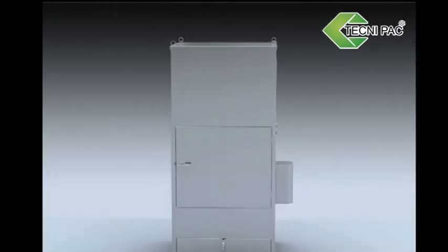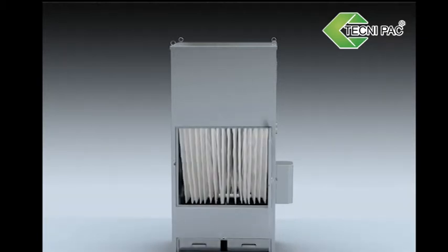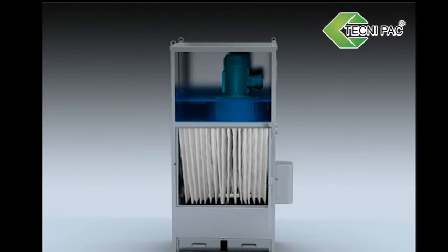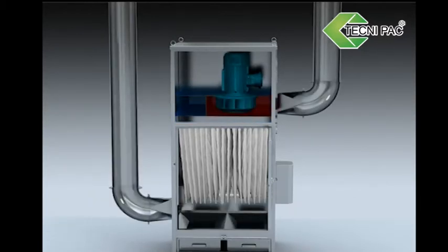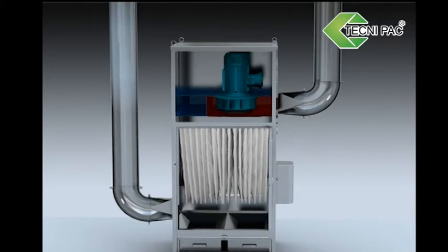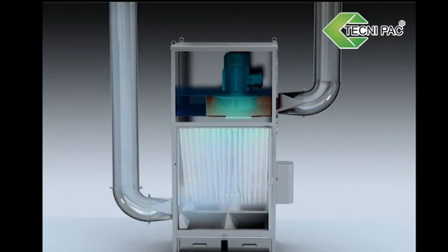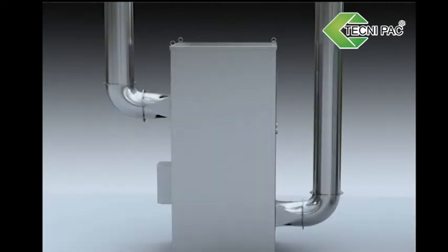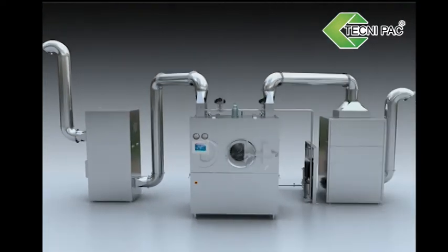Exhaust Machine. It mainly consists of ash drawer, static proof bag filter, ash clearing mechanism, centrifugal fan and stainless steel components. Its function is to discharge the film coating tail gas to the outdoors after dust removal. To make the interior of film coating drum be in a negative pressure state will not only help the coating on the surface of the tablet core dry rapidly, but also enable the tail gas discharged to the outdoors to have received dust removal treatment, thereby confirming the requirements of environmental protection.